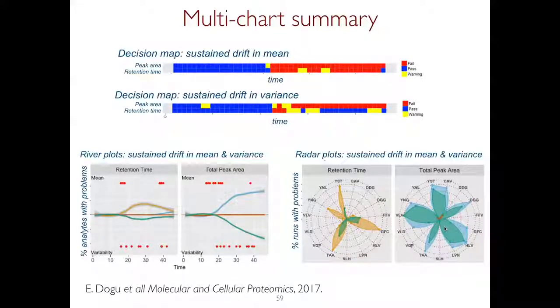This is the current implementation of this tool, but we actually have a very recent new iteration, which is in beta and which we will release very soon. We use machine learning tools to make predictions of in control or out of control for the entire experiment, and we can have error rates of prediction summarizing across all metrics, all peptides, and all types of problems simultaneously.